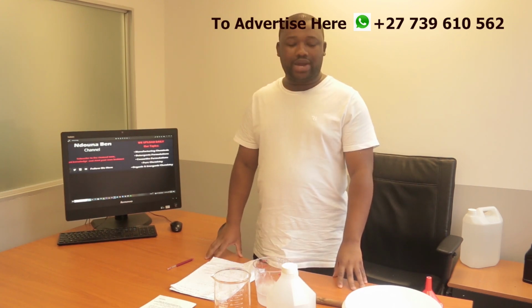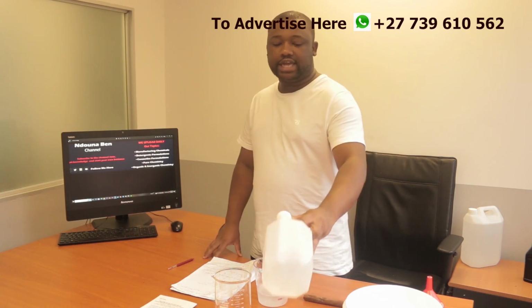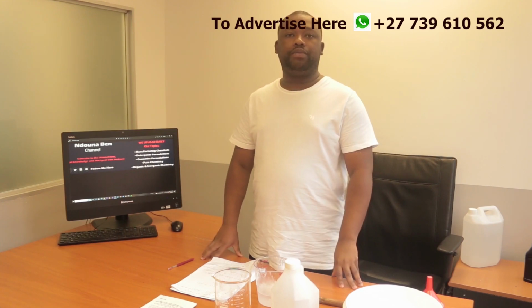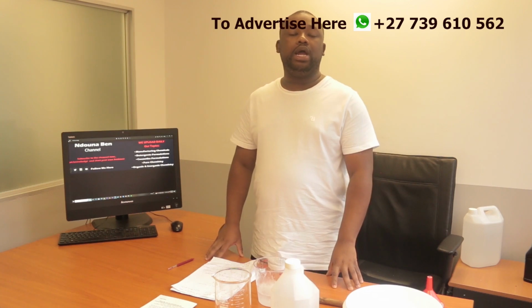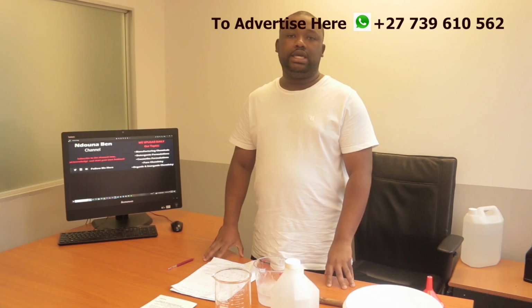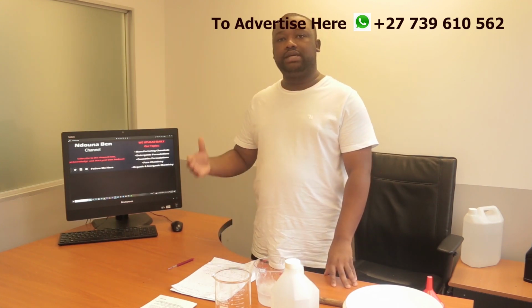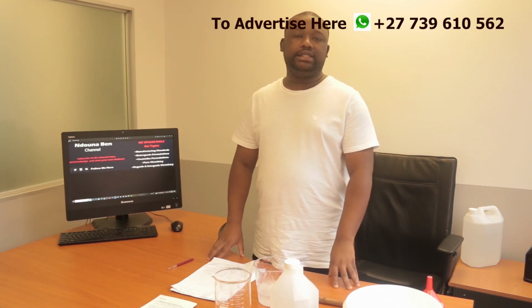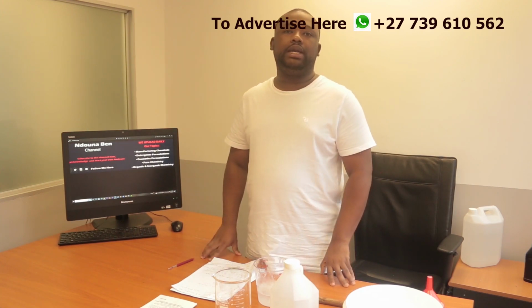As I said earlier on, I'm going to show you how to dilute 95% isopropyl alcohol to 70% isopropyl alcohol. Why 95% isopropyl alcohol? Simply because this is the concentration that we get from the supplier. It can come as 95, as 96, or sometimes 99, but the one that I have here is actually 95, which I'm going to dilute to 70% isopropyl alcohol.